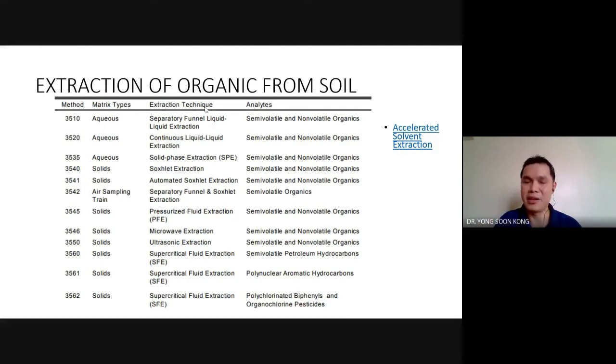And mind you, if you want to remove the solvent, at the same time, you're probably going to remove the organic pollutants as well, because both of them essentially are the same thing. Solvent, most of the time, is also volatile organic carbon. The only thing that you can do to minimize the loss is using chromatography, separate them. Okay? Separate the solvent and also the organic carbon.